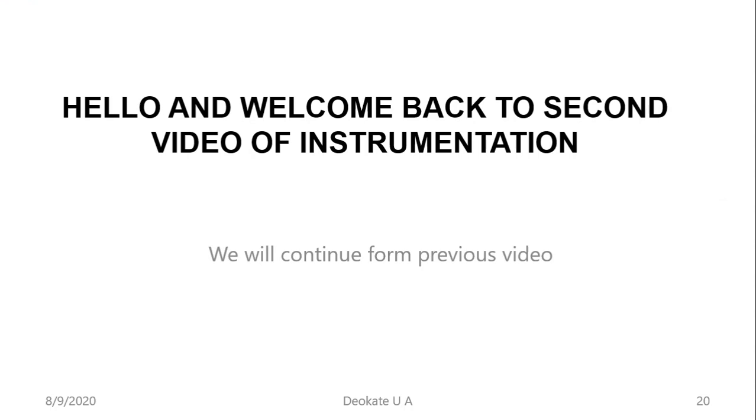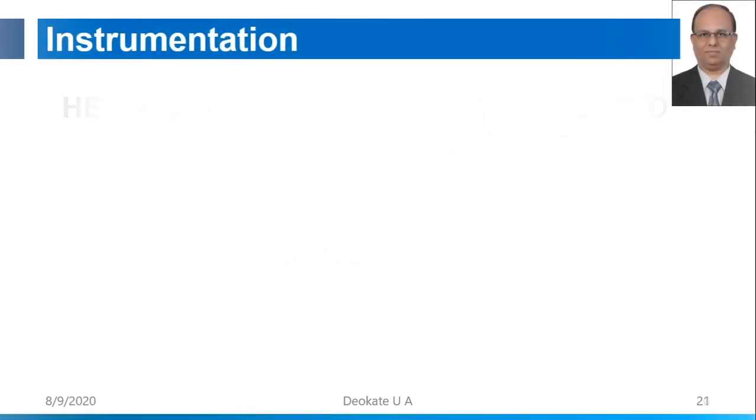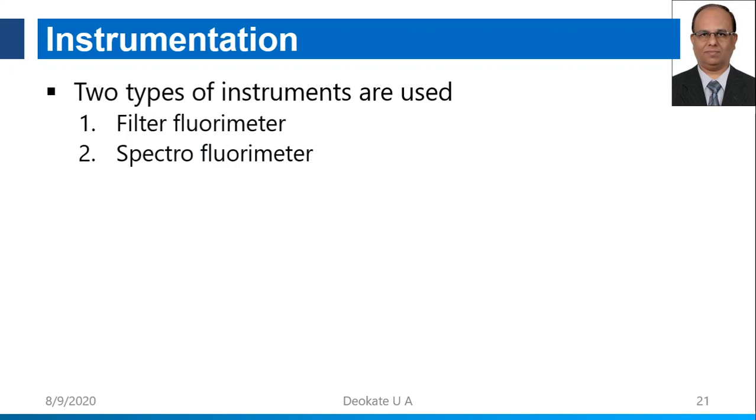Hello and welcome back to the second video of instrumentation for fluorometry. We will continue from the previous video. In the previous video, we learned about the theory of fluorometric determination. Now in this video, we'll start with the instrumentation.